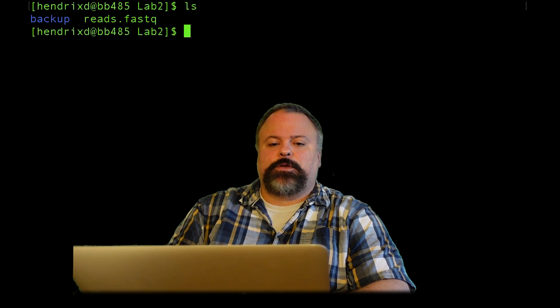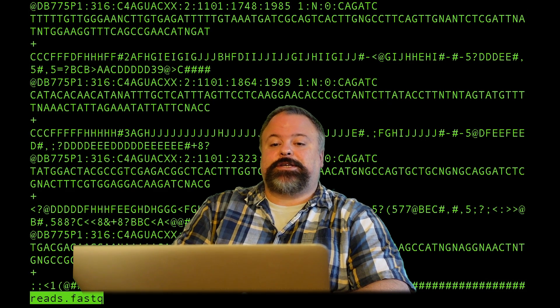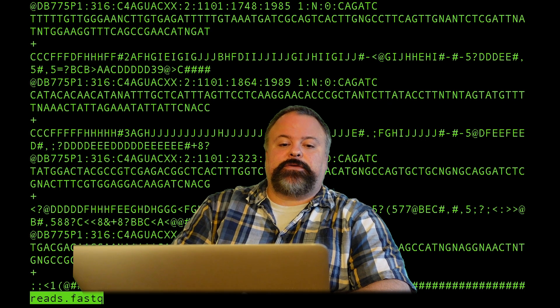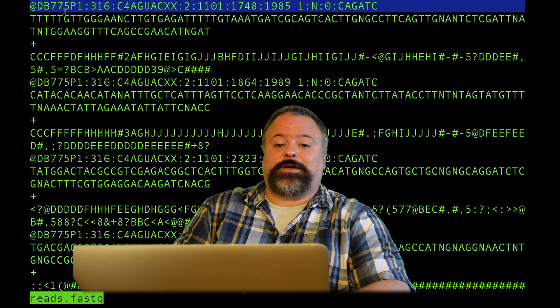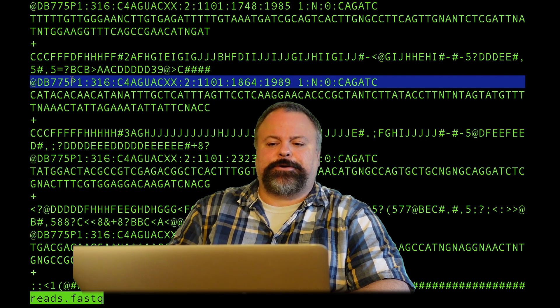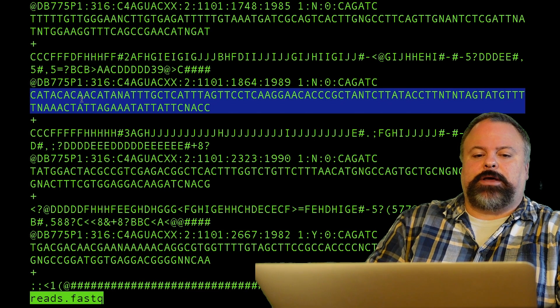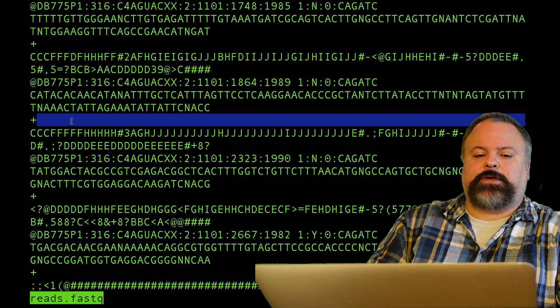I have an example right here in my directory: reads.fastq. This is actually just a sampling of a FastQ file from Drosophila heat shock factor. What I can see here is that there are four lines per record in this file. You have the ID right here, indicated by this at symbol, and then you have the sequence itself, and then in this case a plus sign.